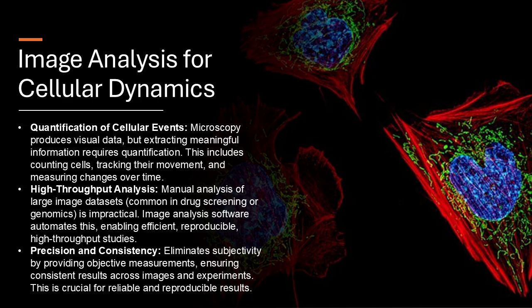Like during interphase when the cell is getting ready to divide. Then comes mitosis where the chromosomes are pulled apart. And finally cytokinesis where the cell splits. So we're breaking down the whole process into each step. Exactly. And with that detail, we can understand the mechanisms. And we can even see when those mechanisms go wrong, like in cancer. We can even screen for drugs that target the cell cycle. It's like having a microscope that can also talk to us and tell us what's happening.